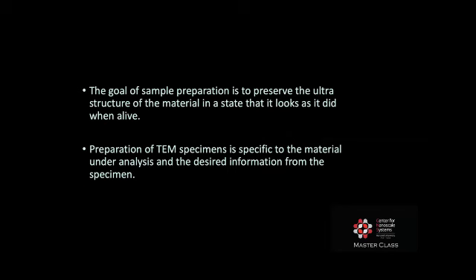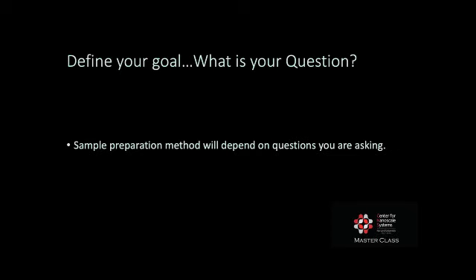Also, it's good to keep in mind that not all preparations are the same. The preparation that you are choosing is going to be specific to the material under analysis and the desired information from that specimen. So, before you get started, you want to clearly define what your question is, and then the sample preparation method will depend on that question that you're asking.